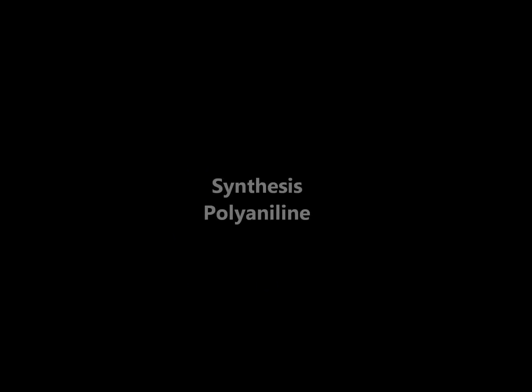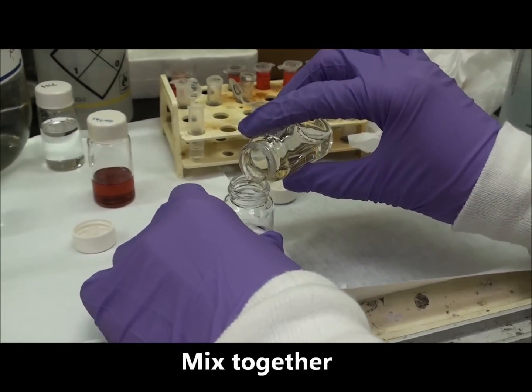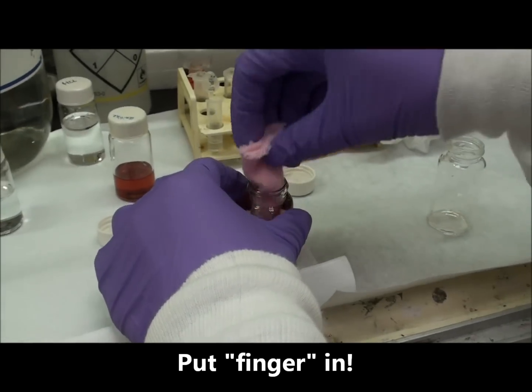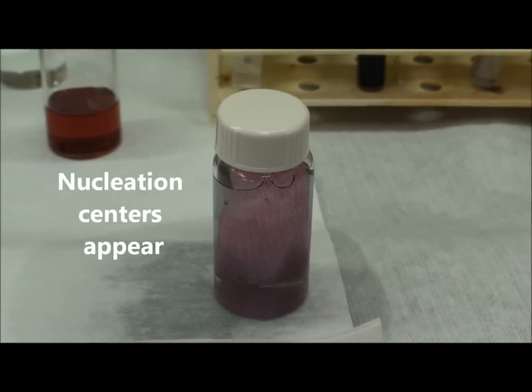The first step is to synthesize polyaniline. Mix them together. You can see some nucleation centers appear.